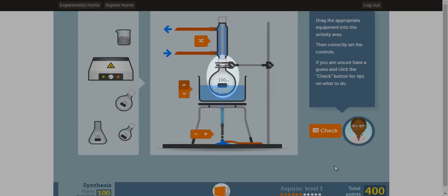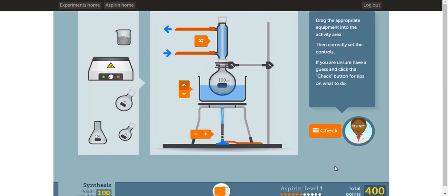If you look closely at the round bottom flask, you will see liquid falling down. During a reflux, the substances in the round bottom flask vaporize and go to the gas state. Then it is condensed in the condenser, going back to liquid, which falls back down into the round bottom flask. This is the completed setup. Once you have the setup complete, you can click check to move on. But before we move on, let me show you another method to set up this reaction.